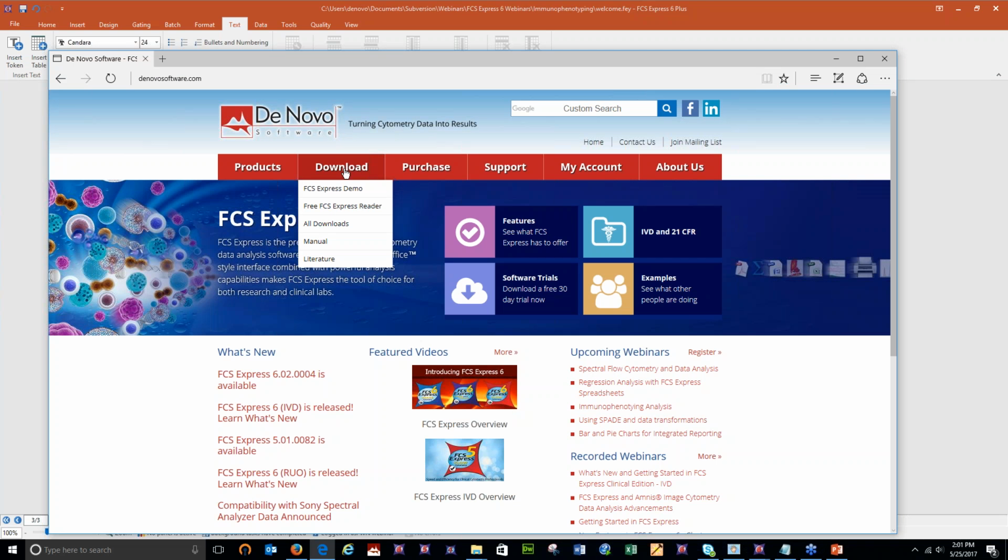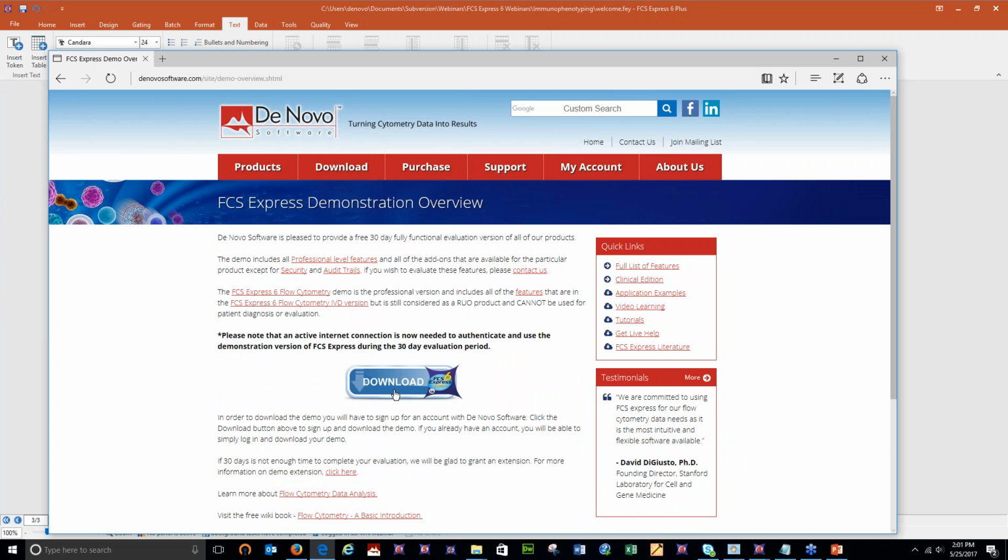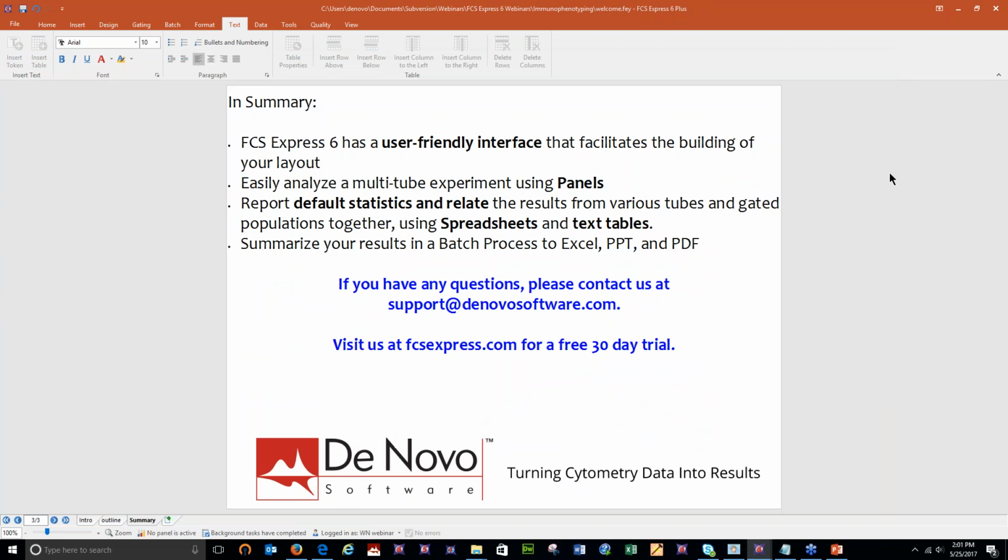If you just come to our website and click on download FCS Express demo, you can download that 30-day demo. Okay, we definitely encourage you to do that. Even if you already have an older version of FCS Express, I've shown you a few new features today that are only available in FCS Express 6, in addition to the greatly enhanced speed and power of FCS Express 6. We really encourage you to try that out.